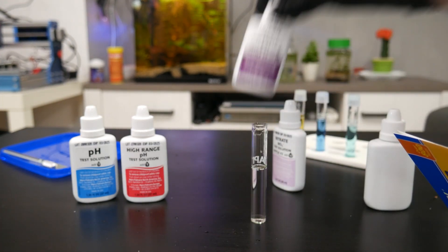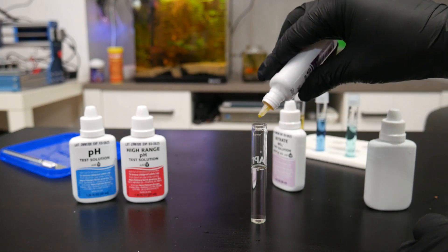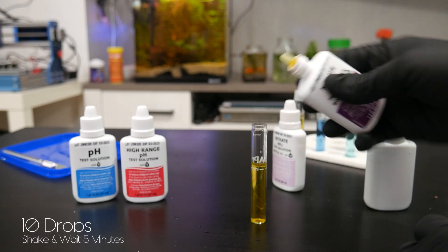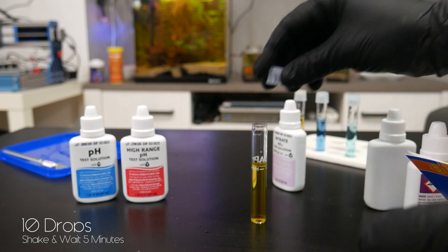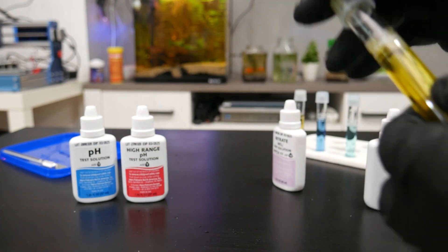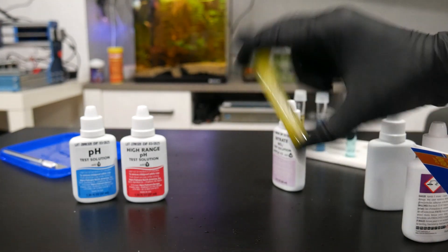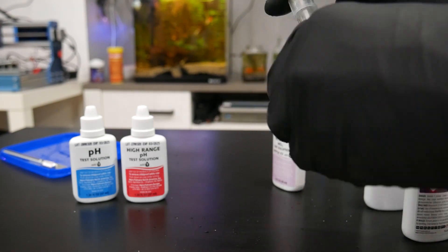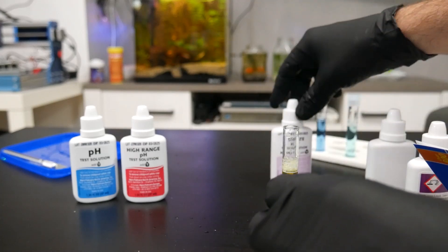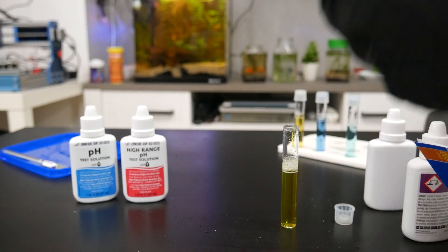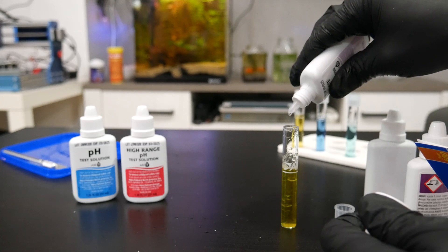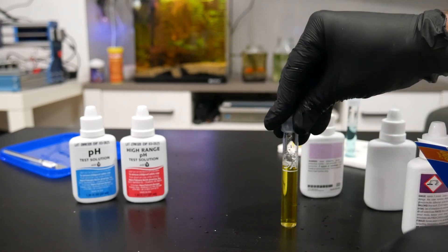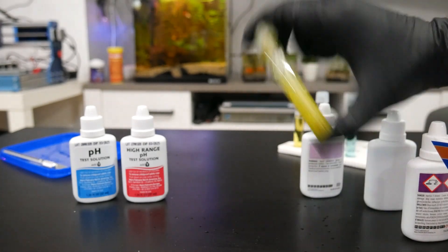The next test is nitrate. We need ten drops from the first bottle. Then we need to shake vigorously for thirty seconds. Now we need to add more ten drops from the second bottle and shake it for one minute.